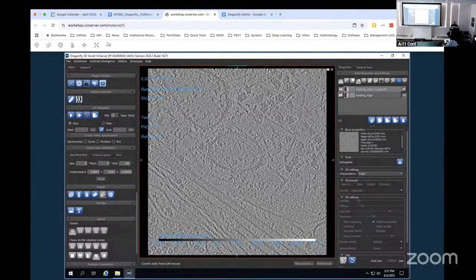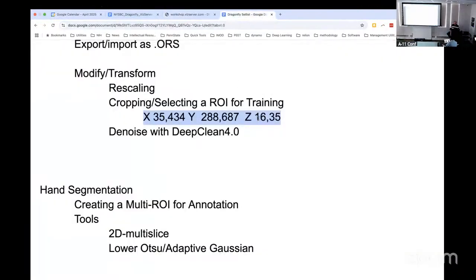I have another question. Yes. Can you explain why we went from 50 slices to 1? Yeah, sorry. That was here in the Z, for the cropping, but it's not critical. I was just trying to use a very minimal piece of data and to show you how little data you had to use to train a network. But you can make it any size you want.